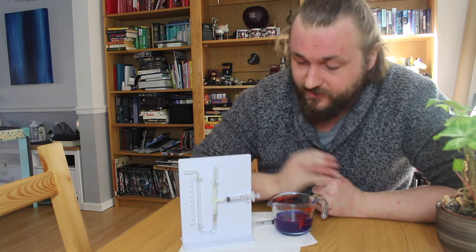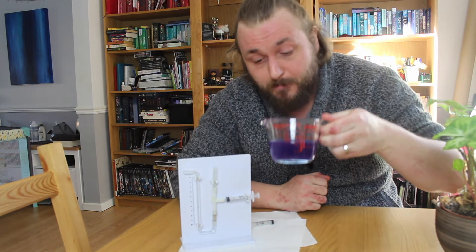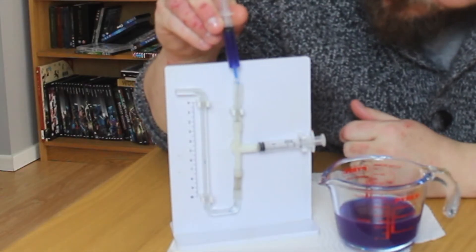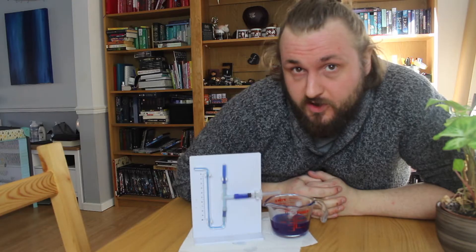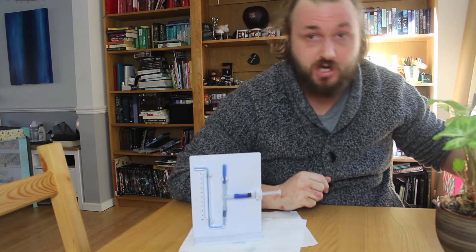I'm going to put some water in this, because being made of clear pipes it doesn't really show what's going to happen. I'm going to use some blue coloured water — water with blue food colouring — so you can see the passage of the water a little bit easier. Hopefully it's more obvious now that you can see what's happening with the blue liquid inside this potometer.